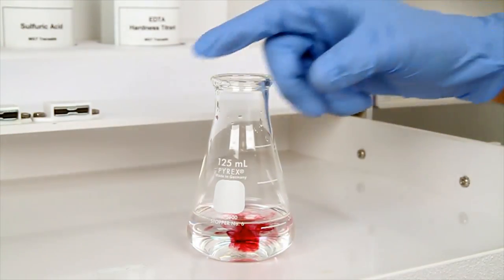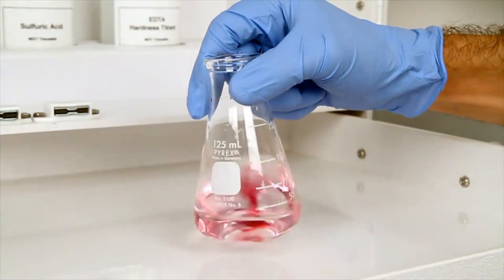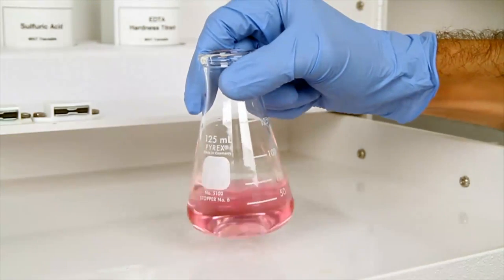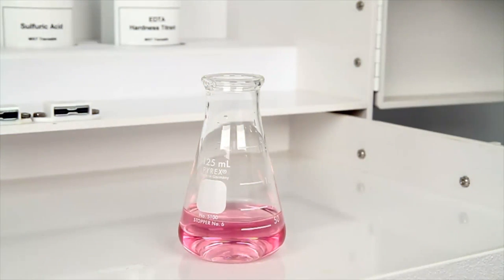The sample will turn red if hardness is present. If the sample turns blue, then hardness is zero and the test is complete. In this example, the sample turned red, indicating that there is hardness to be titrated.